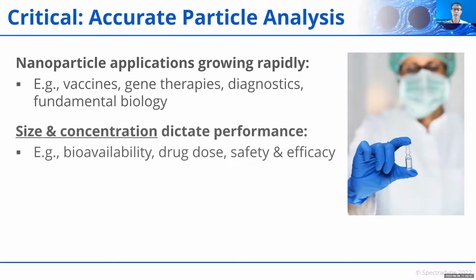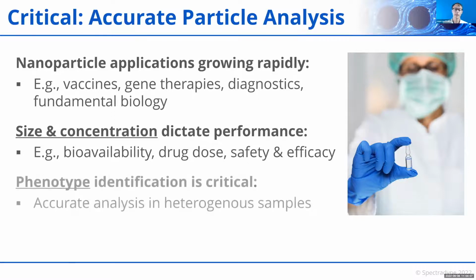For these nanoscale materials, particle size and concentration directly dictate their behavior and their performance. Size and concentration are critical parameters that determine particles' bioavailability and biological access, and ultimately, in the case of a therapeutic, a drug's dose, safety, and efficacy.